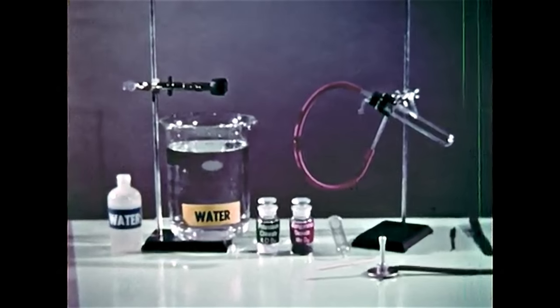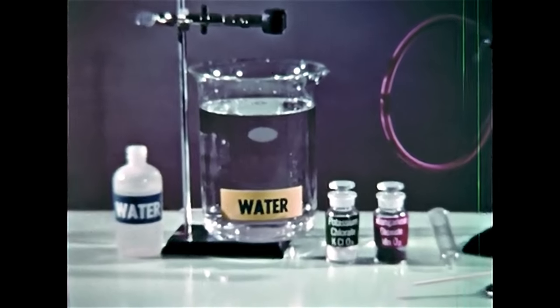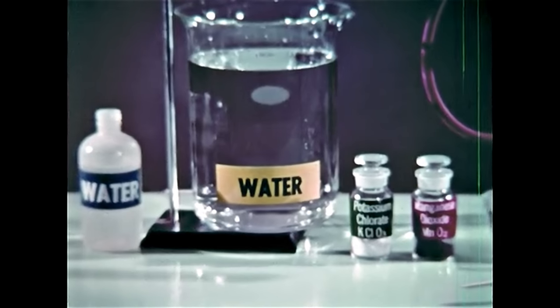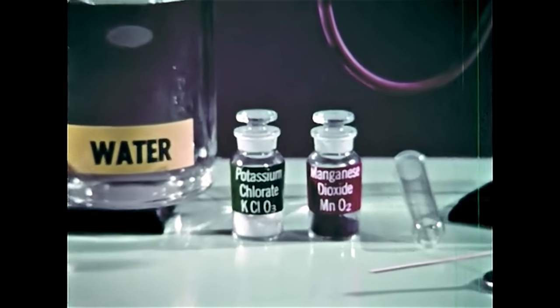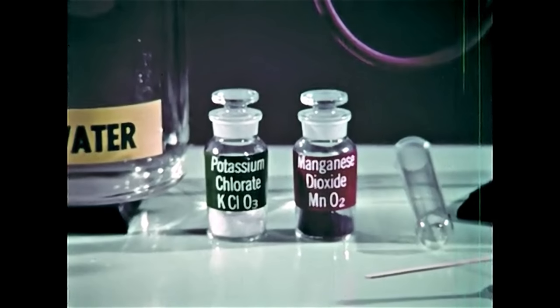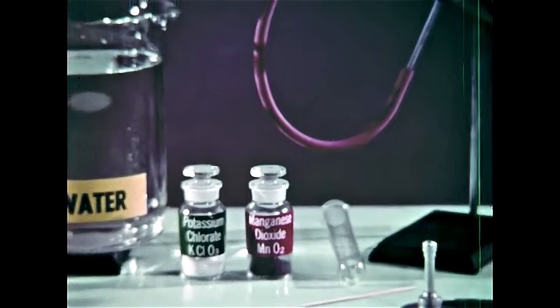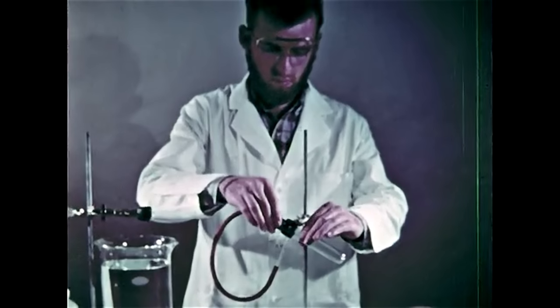In this demonstration we'll collect the oxygen by driving it into a test tube, which will be filled with water and set in this beaker. The compound containing oxygen is potassium chlorate and the catalyst is again manganese dioxide. This is the most common and convenient way of preparing oxygen in a laboratory.